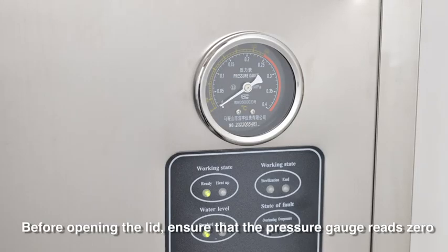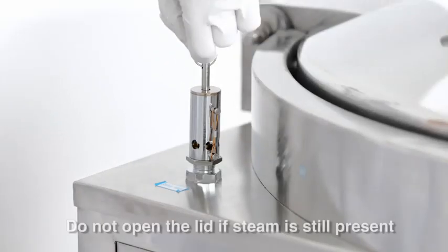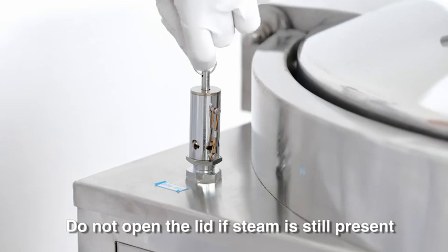Before opening the lid, ensure that the pressure gauge reaches zero. Pull the safety valve ring upwards. Do not open the lid if steam is still present.